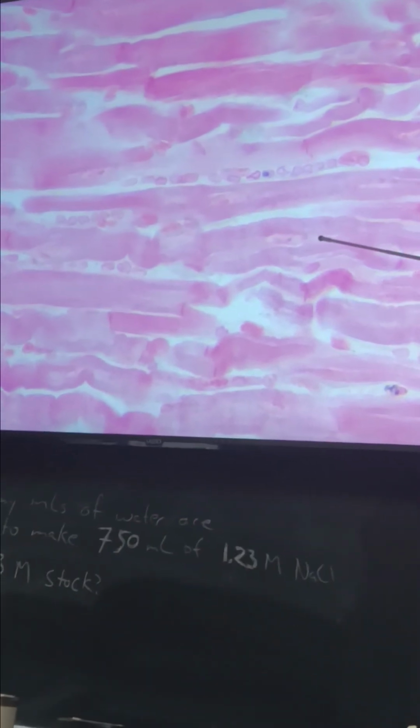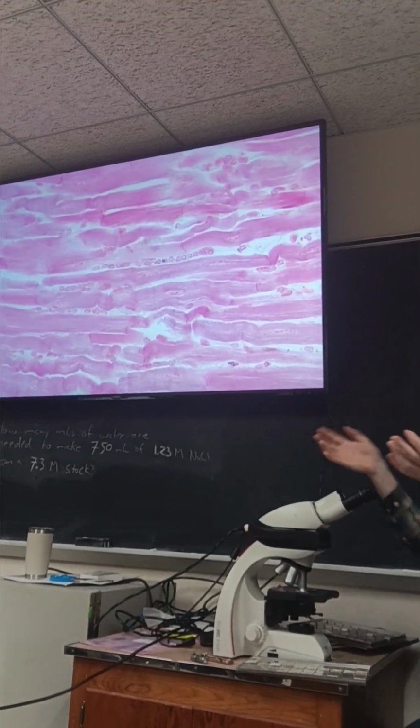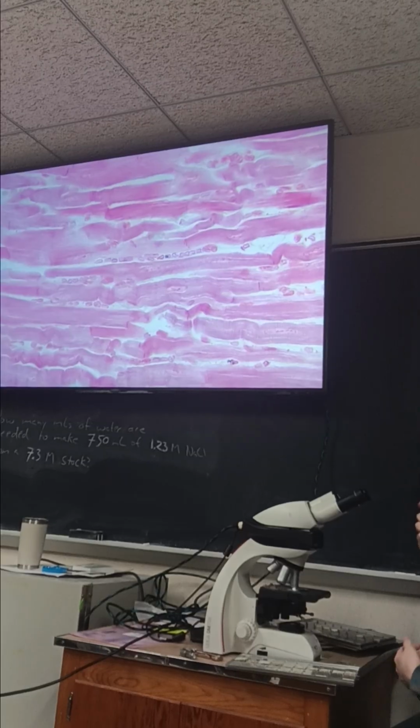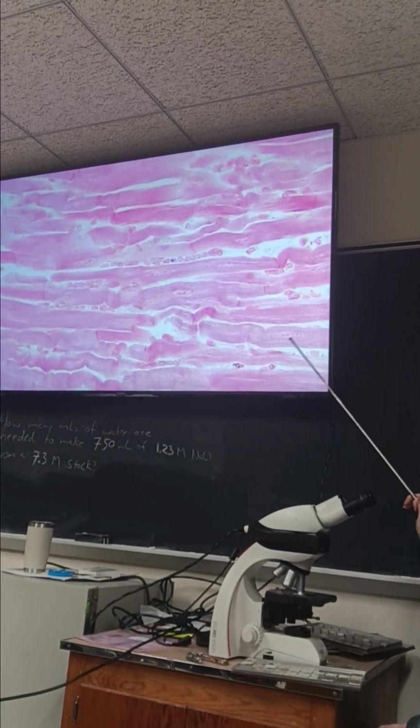This is just protein, but right here, it's a little bit lighter. It's literally because inside that cardiac muscle cell is this fat nucleus, and all the protein fibers that make your heart move have to move around it. And so it leaves, oftentimes, little clearings on either side of the nuclei. Even if you don't see that, those nuclei are right in the middle of those cells.